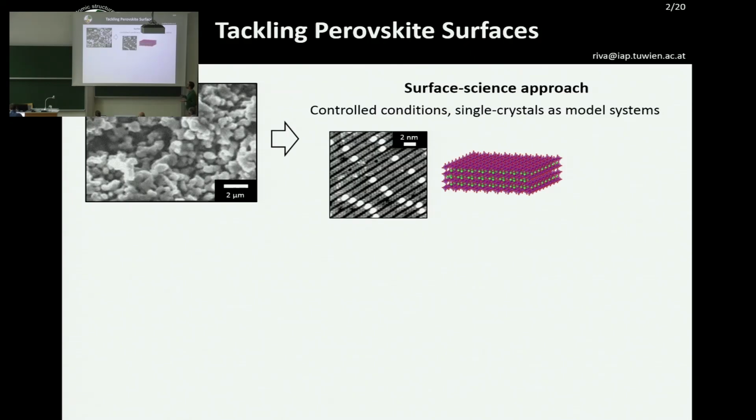That is, we pick one or a few crystal orientations and study single crystals of the same material under those orientations. And we do this under very controlled conditions, typically ultra-high vacuum or very clean conditions. The advantage is that we can then approach our tip and get atomically resolved images, and we can interface with our theoretician collaborators.